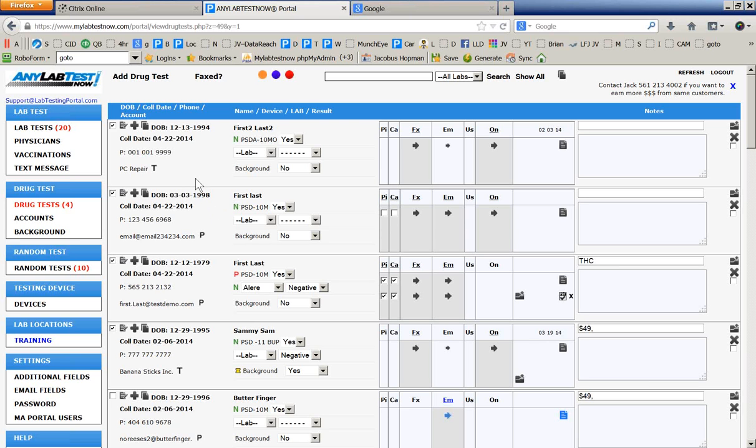So there are a couple of things about how you want to manage the portal. You see here these orange, blue and red dots. How often have you sent out to the lab and you don't know if everything has been reported within the promised time?